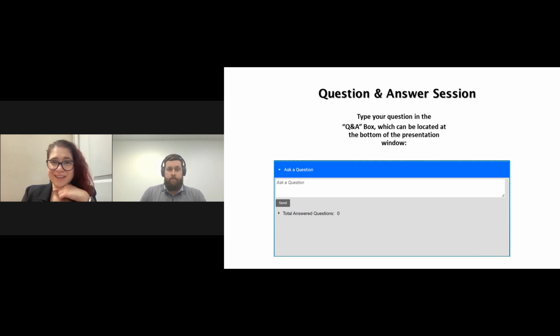Perfect. Okay, next question. Can you use cryo focusing for trace analysis, including gases? Absolutely. It depends on what type of cryo focusing you're looking to do. If you're looking for LN2, carbon dioxide, things like that, we do have specific modules that can be installed to perform cryo focusing on the head of the column. Some of our sample introduction techniques also have built-in Peltier cooling as well, so not necessarily cryo focusing. It all depends on the temperatures that you want to go down to and the analytes that you're interested in cryo focusing. But we do have some available options to potentially assist with that.